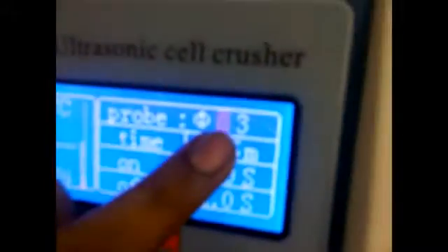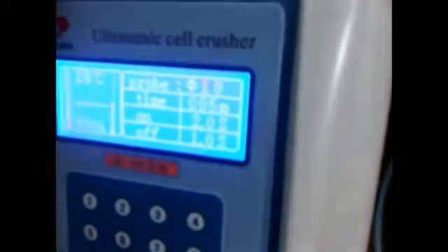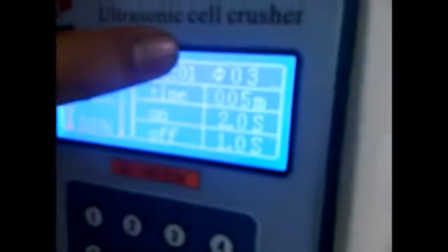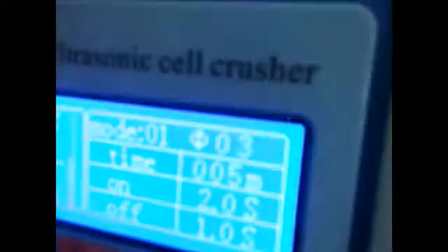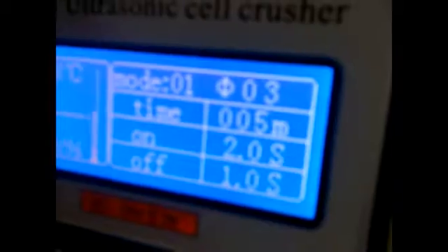Here we can select our probe. At the moment we are having a 3mm probe, so we have selected 03. If we want to change it with the up and down cursor, we can change it like 6mm, 8mm, 10mm, 1mm. Now again we are at 3mm - press set and it takes the value. Mode is a programming number; we can store up to 99 programs.